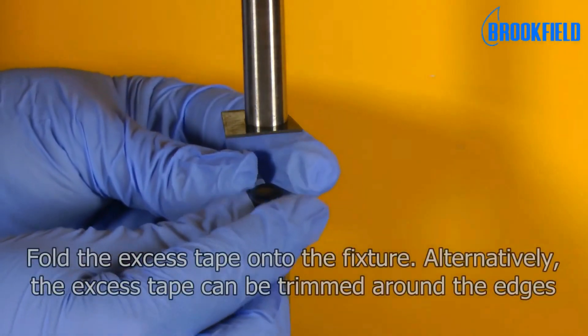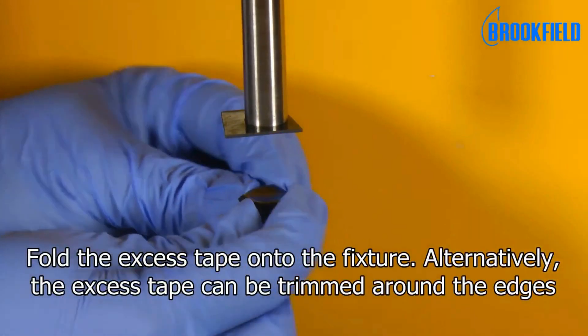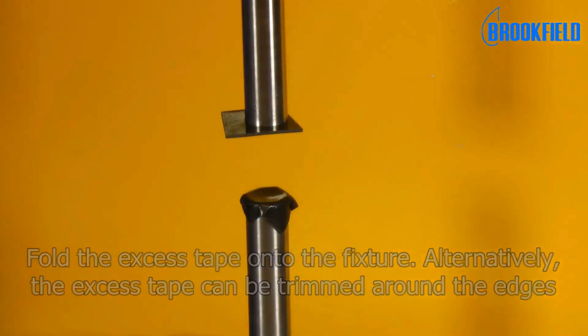Fold the excess tape onto the fixture. Alternatively, the excess tape can be trimmed around the edges.